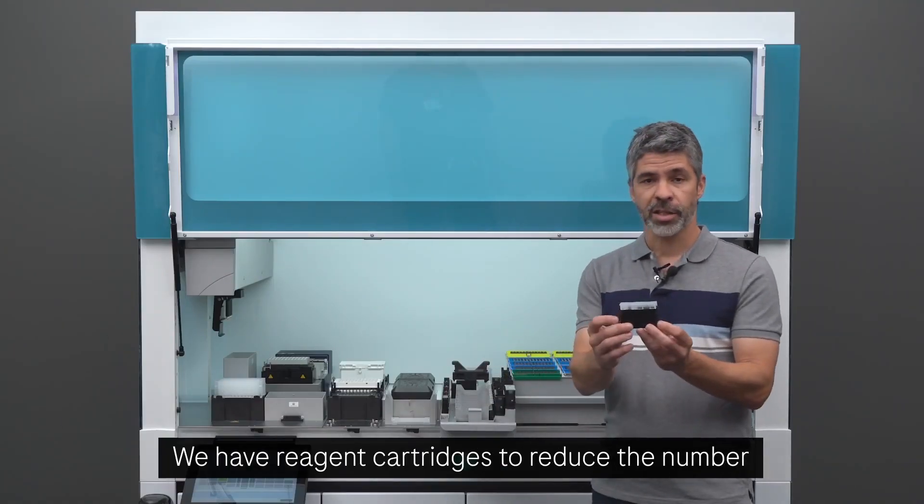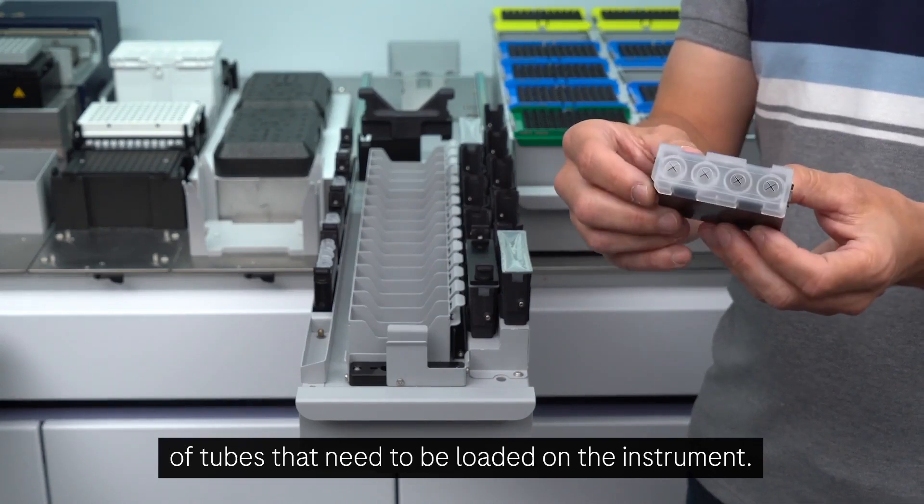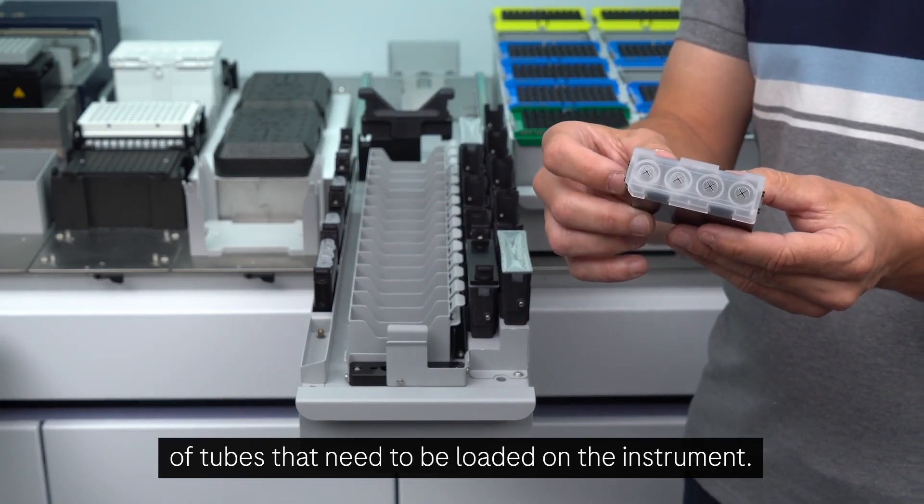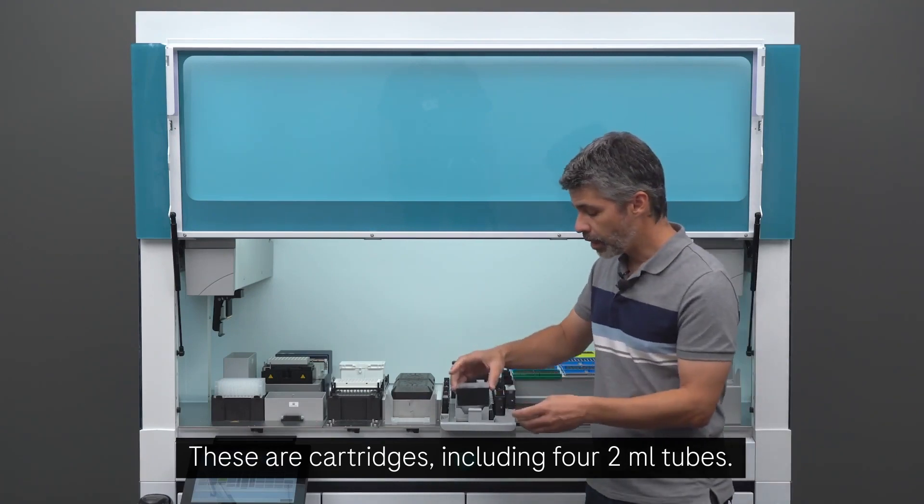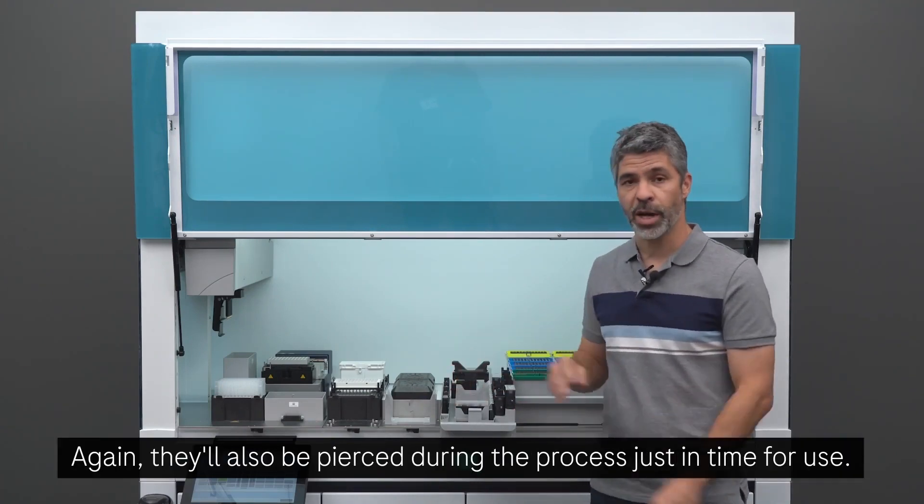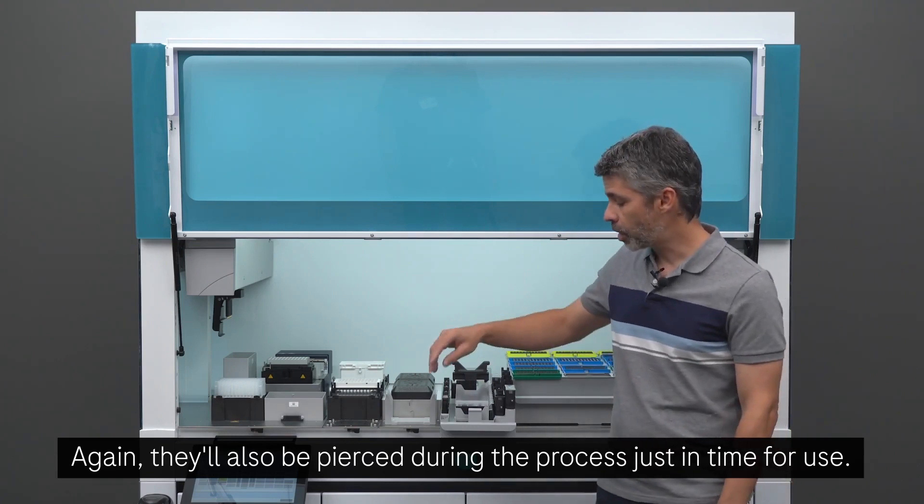We have reagent cartridges to reduce the number of tubes that need to be loaded on the instrument. These are cartridges including four 2 mL tubes. Again, they'll also be pierced during the process just in time for use.